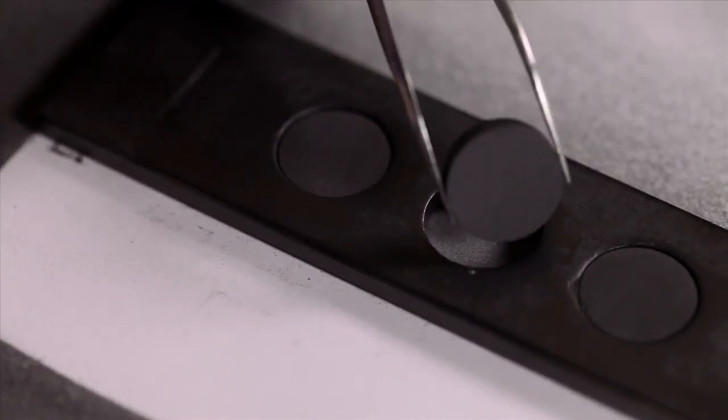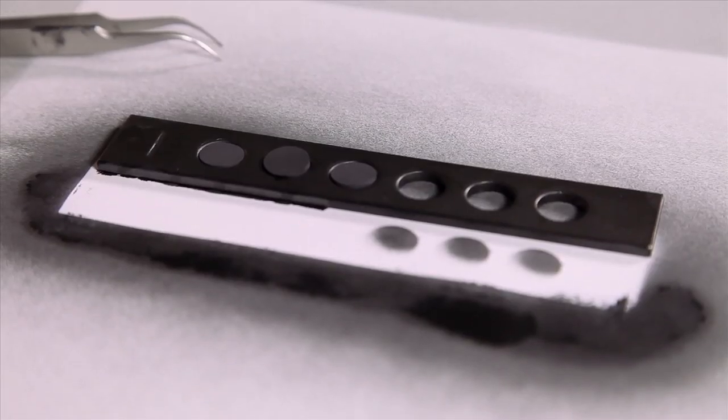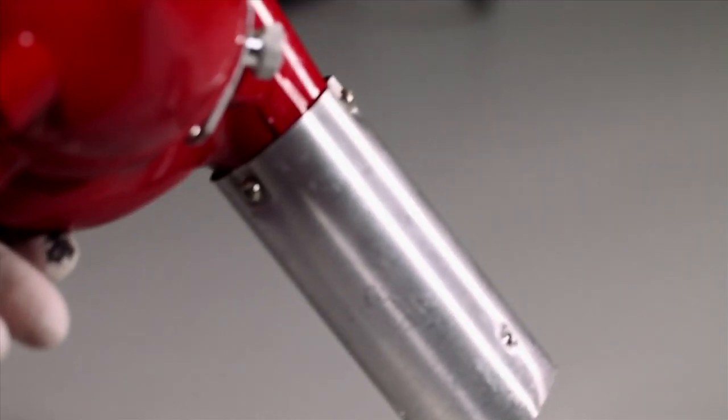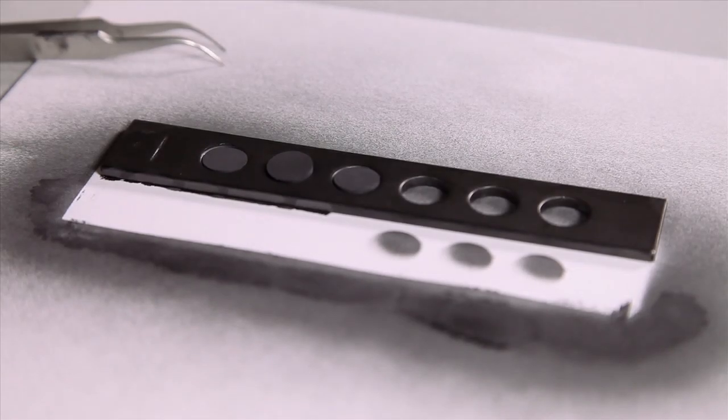We don't touch the surface of the samples after we apply the graphite, because we don't want any oils or contamination from our skin on the sample. So I heat it again and then apply graphite.